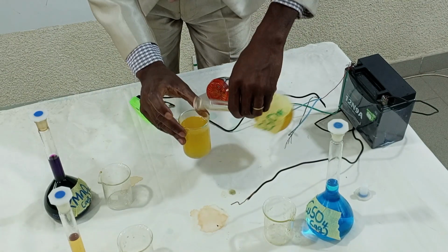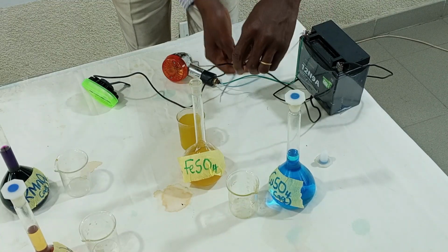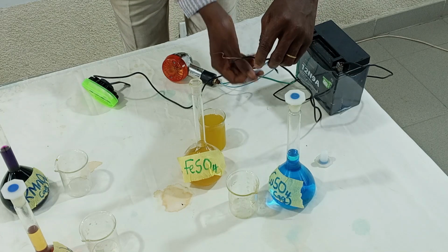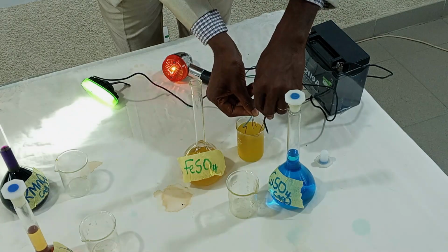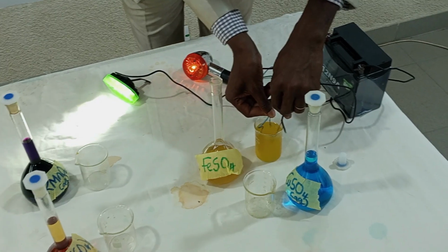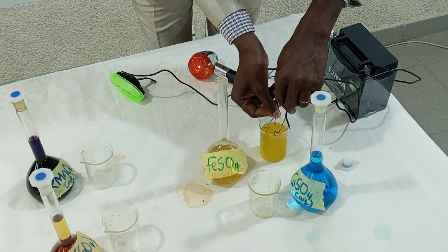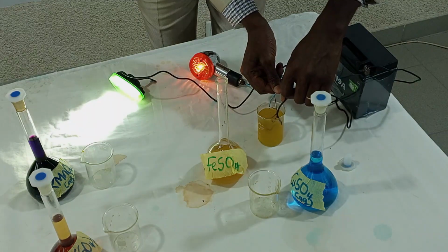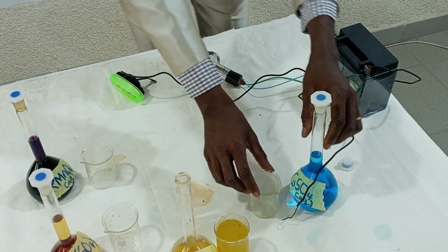Now, this iron 2 sulfate contains Fe2+ ions and SO4 2- anions. These are ions and they can conduct electricity. Let's verify it. You see, that produces light because it produces Fe2+ and SO4 2- ions, which can conduct electricity. Good. Now let's demonstrate the copper 2 sulfate.